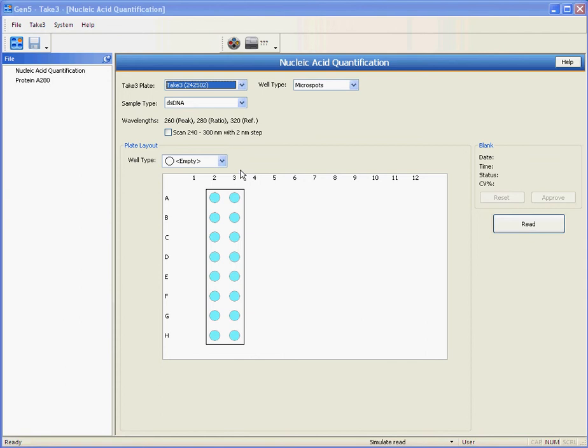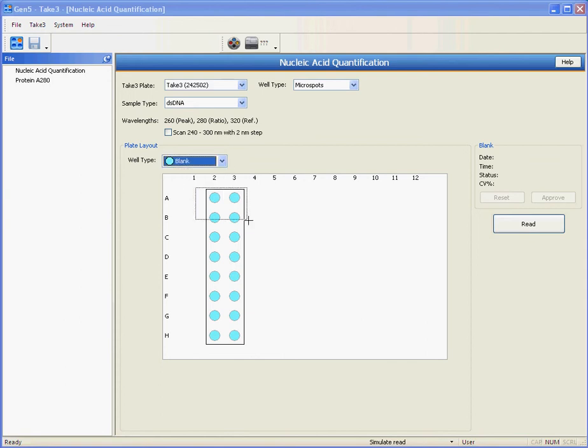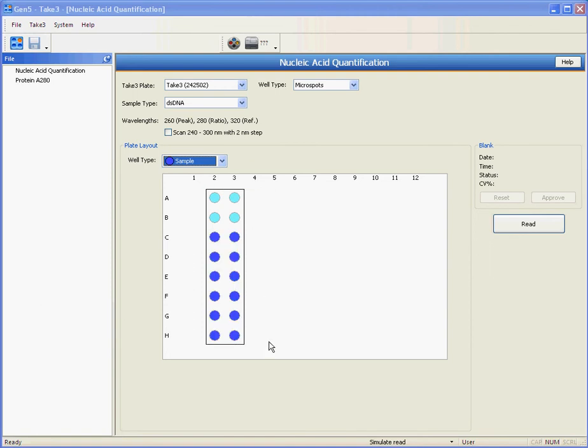Another thing that's been updated is the ability to measure blanks and samples on the same slide. As a result, what was a two-step process is now a one-step process.